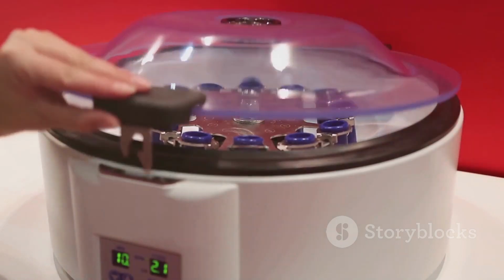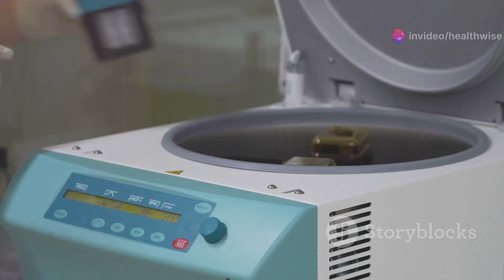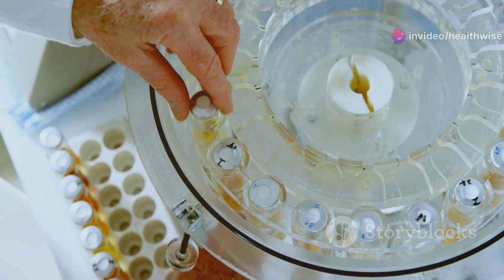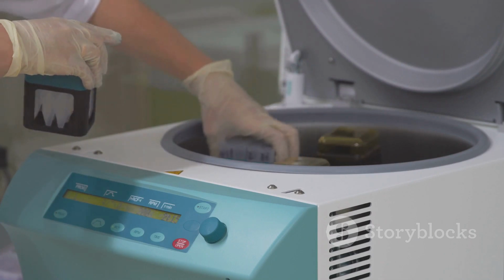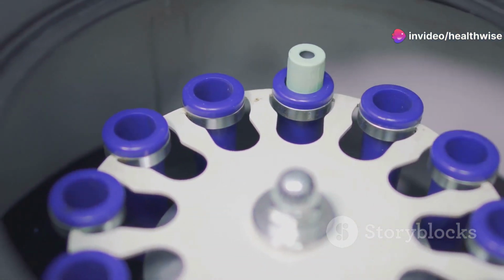Now that we know what a centrifuge does, let's take a peek under the hood and see how it works. Don't worry, it's not as complicated as it sounds. At its heart, a centrifuge is a pretty simple machine. It has a rotor, which is like a spinning basket, that holds the sample tubes. The rotor is driven by a motor, which provides the spinning power. The faster the motor spins, the stronger the centrifugal force.